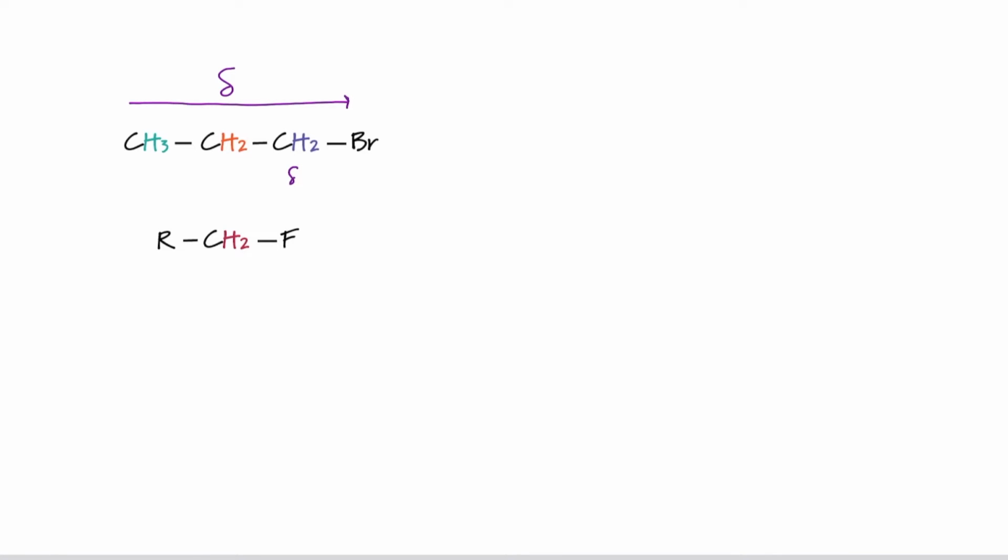But we see a chemical shift of around 3.4 for these two protons, 1.9 and 1.0. Similarly, if I switch my bromine for a fluorine, the chemical shift jumps from 3.4 for those protons to 4.5. Fluorine is much more strongly electron withdrawing. Those protons are more strongly de-shielded.